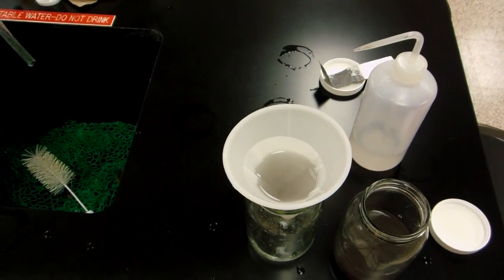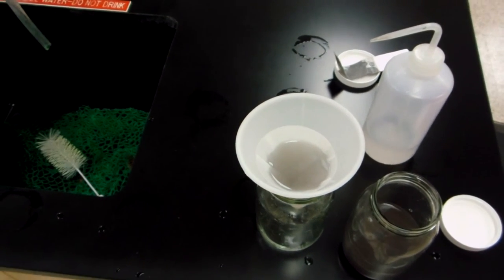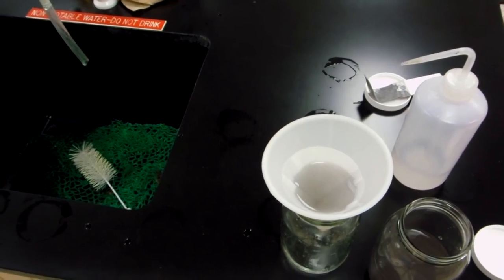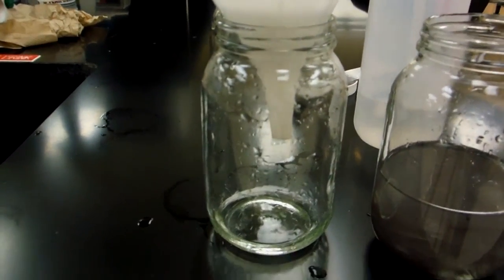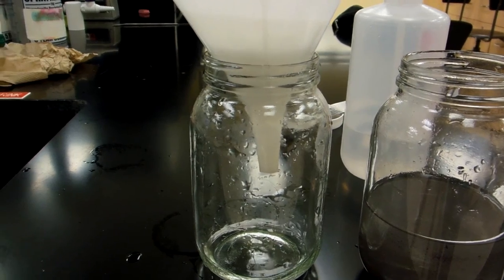So, as you can see, the flow rate is much slower compared to the previous filtering sessions. This is a lot slower. But it is still filtering, and it eventually all gets filtered. And once that's done, we will now move on to the final steps.